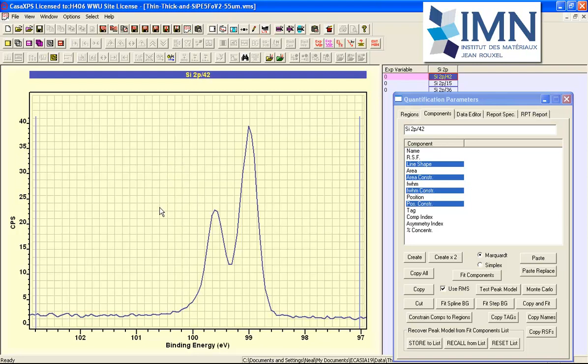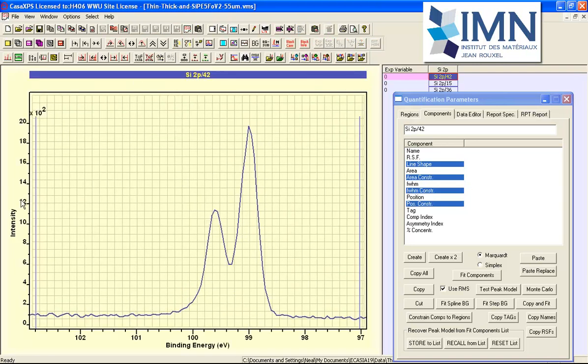All of these together have produced a pair of peaks that are well resolved, and we've had to collect for a long time to make up for the fact that the sensitivity has been reduced, so the count rate is relatively low, but the intensity is still relatively high. High enough that the signal to noise is very good.